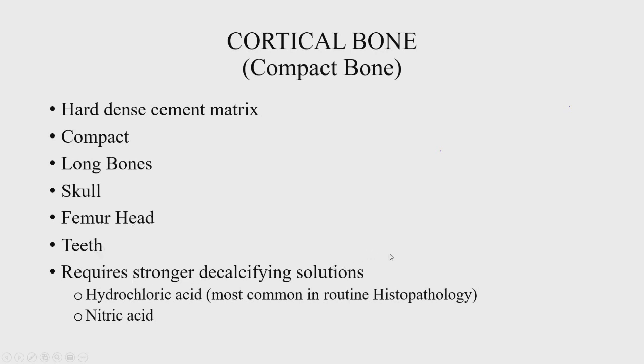So then femur heads, of course, and I mentioned teeth. Now these require stronger decalcification solutions when you're working with them. And so I did mention this down at the bottom. We're going to talk about this later, which is the hydrochloric acid. It's pretty much the strongest form because it will help break this type of bone down. If you use a less aggressive decalcifier, it's going to take longer. It'll take more solution changes. And for routine practical histology, it just takes too long. So you have to basically look at what you're going to use.